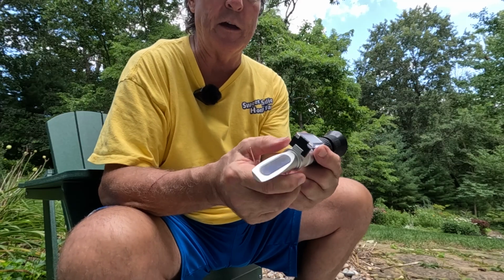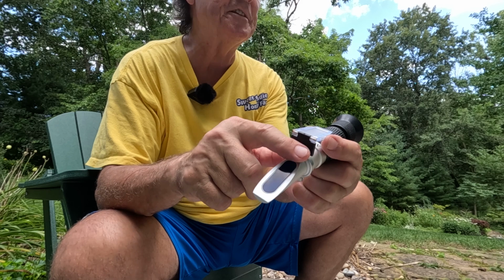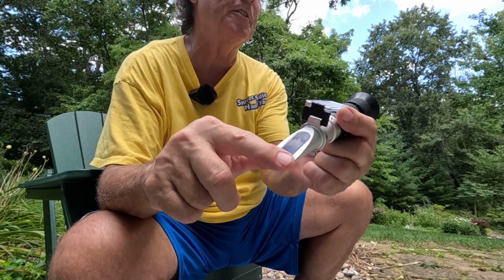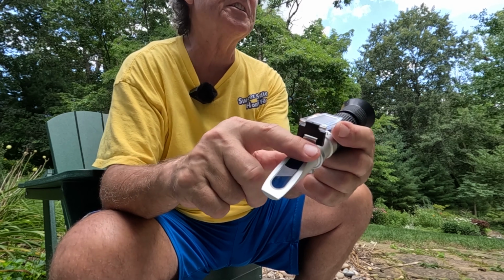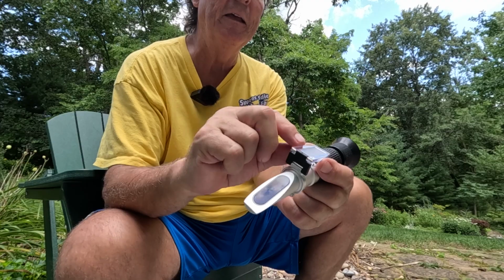But so what do you do with it? How do you make that happen? Well, you open up your refractometer and you get your extra virgin olive oil and you basically just wipe it across the front, a good solid wipe across. You want it completely filled up. I'm going to show you what that looks like with honey in just a second, and then you close it off.